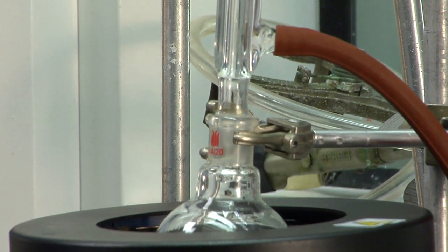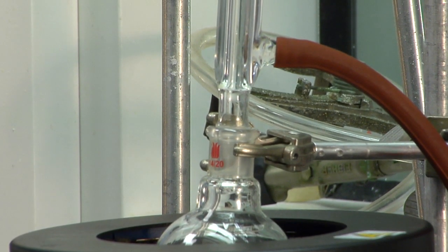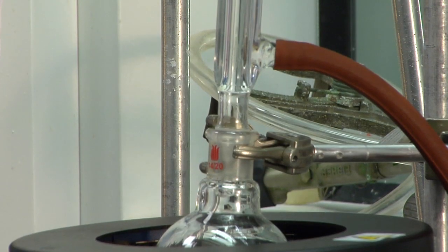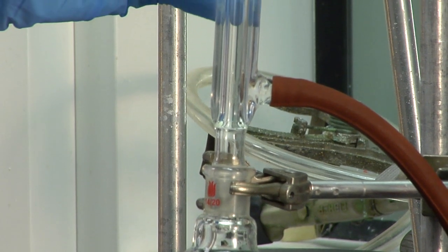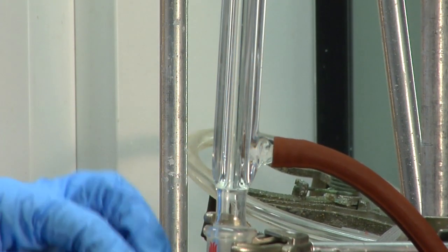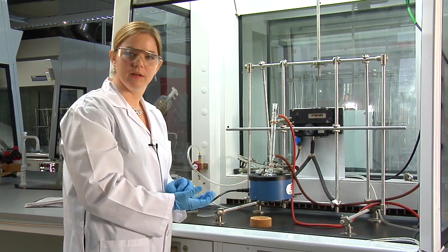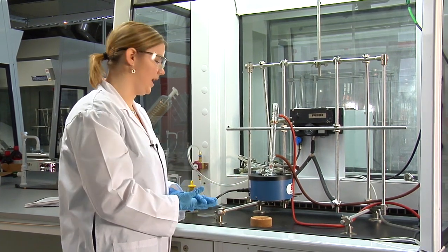So what's happening here is we have it at a boil, so the solvent is evaporating, and then it's going to condense on the walls of the glass, cooled by the water, and then it's going to drip back down. And this is going to help us heat the reaction without losing the solvent and the products that are in there.